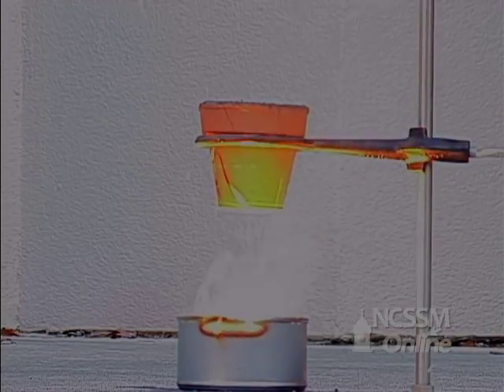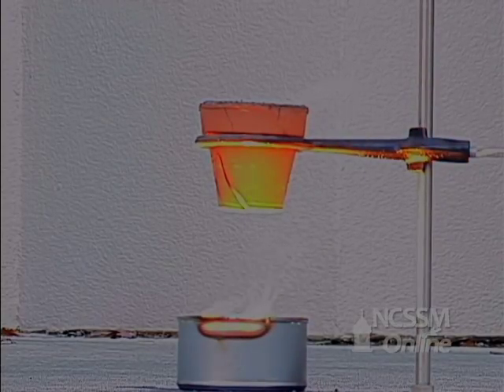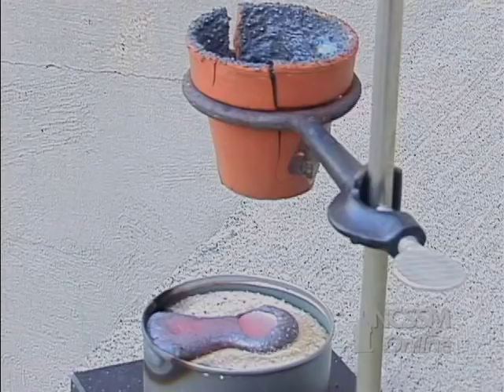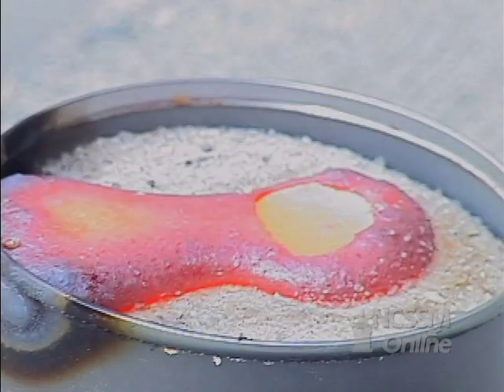The reaction is so exothermic that the iron is melted and drips through the bottom of the flower pot. The melting point of iron is about 1500 degrees Celsius.